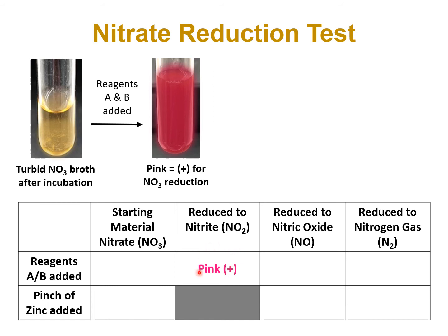But again, when do we consider pink to be positive? Right after the addition of those two reagents. Again, why am I stressing so much the idea of when you are seeing this red color? Because you guys are going to see in a few minutes how red could mean something totally different. Okay, now, this is one result that you would get.